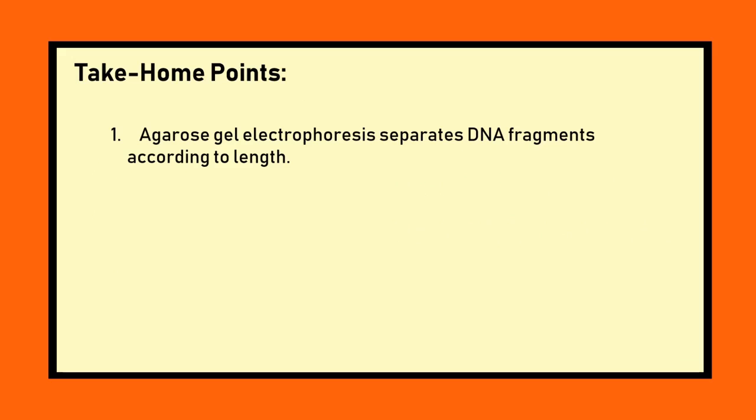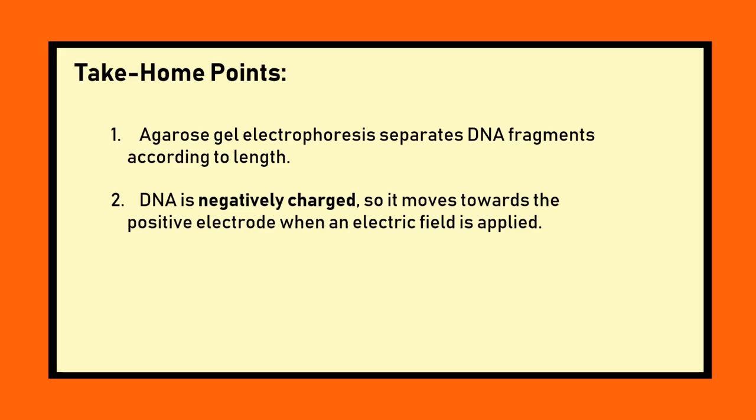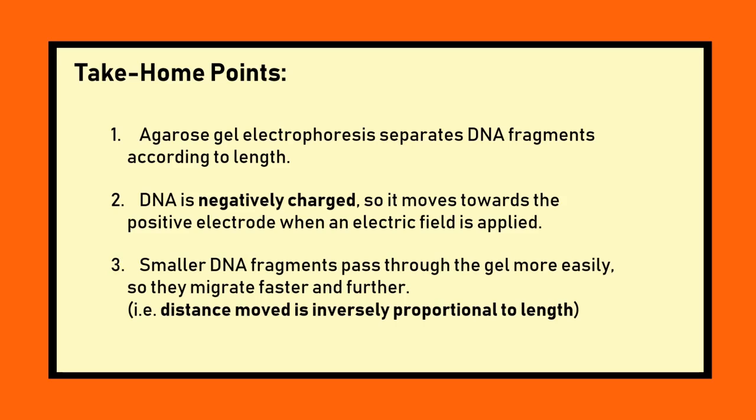Take-home points. Agarose gel electrophoresis separates DNA fragments according to length. DNA is negatively charged, so it moves towards the positive electrode when an electric field is applied. Smaller DNA fragments pass through the gel easily, so they migrate faster and further, i.e., distance moved is inversely proportional to length.